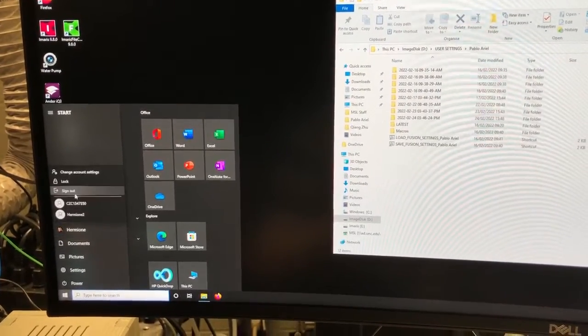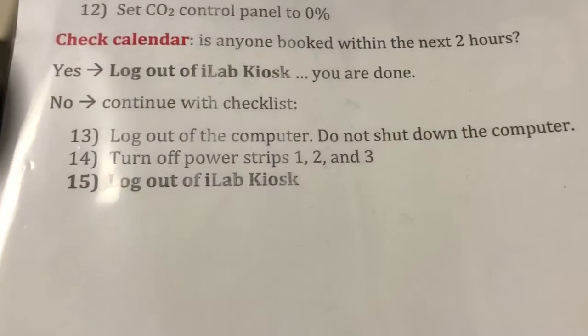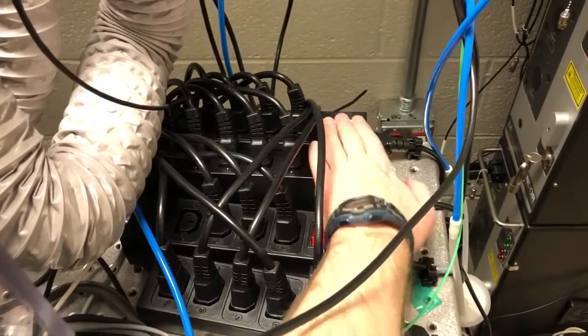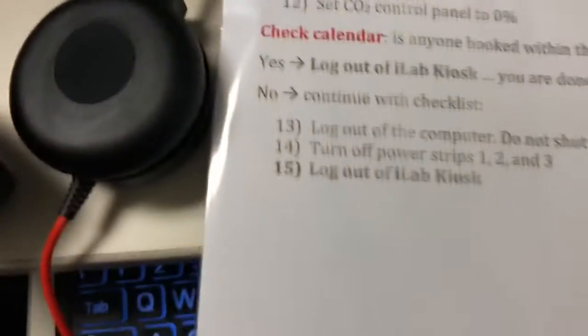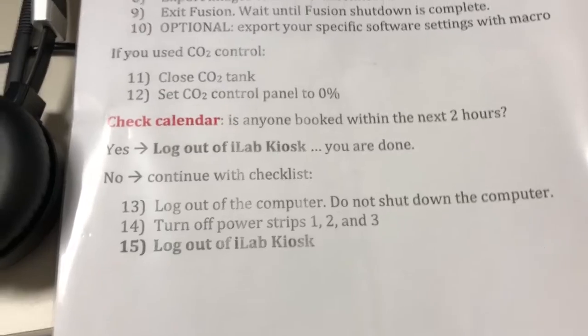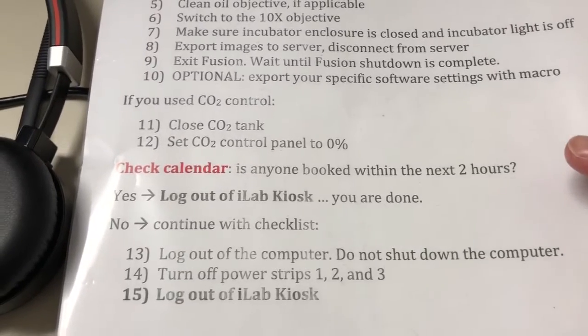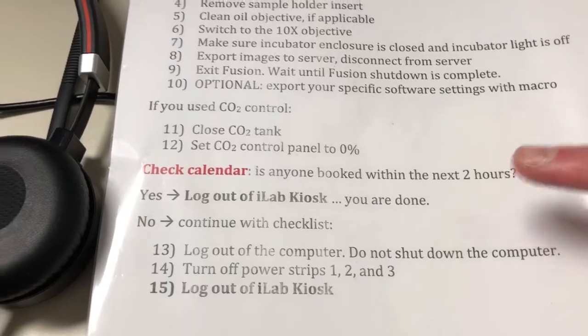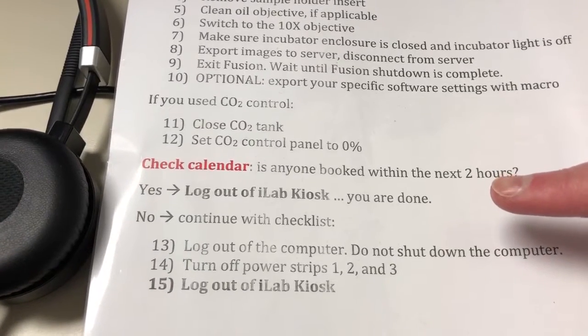So we're going to go to the user account and sign out. Then you're going to turn off power strips one, two, and three. At that point you're ready for the last step, which is to log out of the ilab kiosk. If someone weren't coming within the next two hours, you would have already logged out of the ilab kiosk at the earlier step.